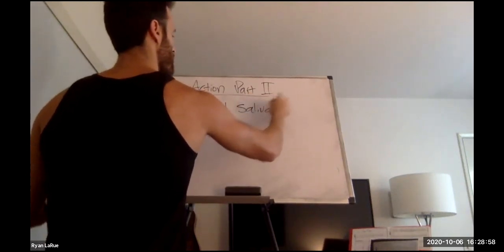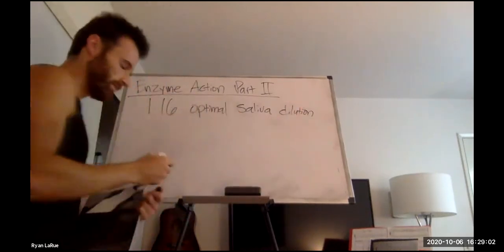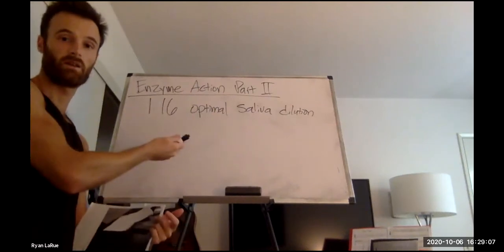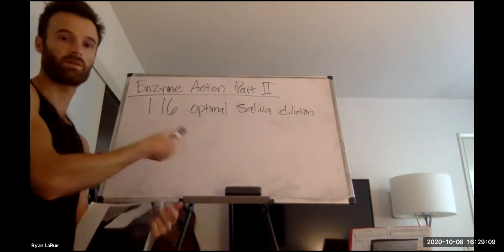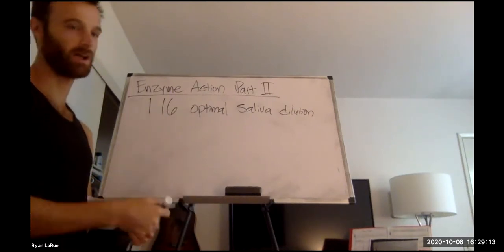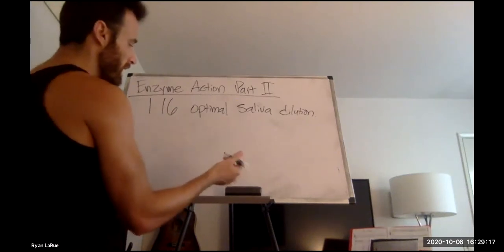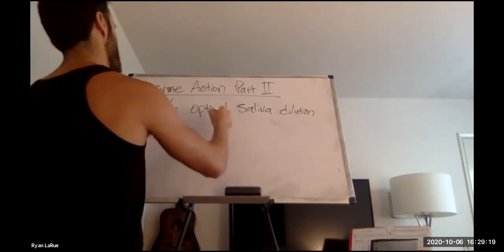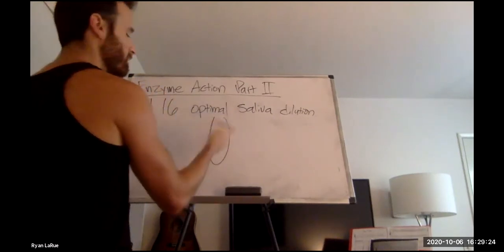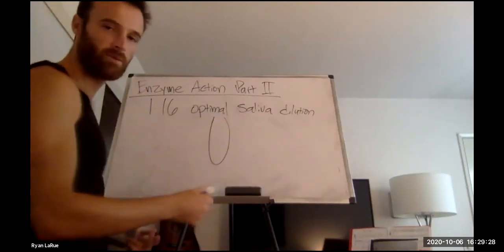So for this lab, we're going to want to go ahead and immediately prepare a test tube of optimal saliva diluted to this optimal concentration. So we're going to collect saliva again, fun. And to make this, we're going to get a fresh test tube, right? And we're gonna make this optimal dilution just right away.